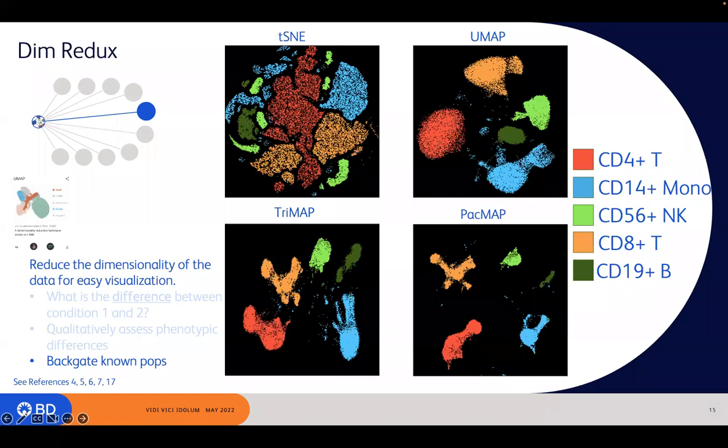Likewise, it also puts them fairly close to the monocytic cells and the CD19s, but they're not very close or not very highly related to these CD4 T cells, which are essentially across the ocean here. In all of these images, that is the case. So the more distance that exists between these islands or blobs, the general idea is that those cells are going to be less related to one another, and that they don't share a ton of markers in common.